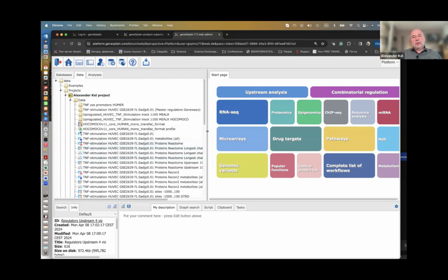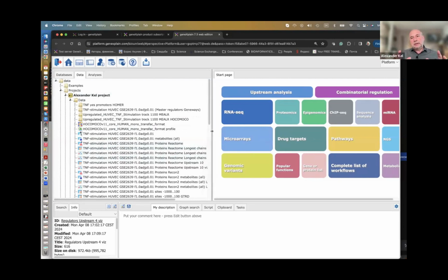And important, of course, in this free account which we are showing here, you can do everything, although you're a bit limited with the space. So you have to be careful not to exceed the space which is offered for free. If you get more results, you can, of course, download them to your computer and then delete the file.